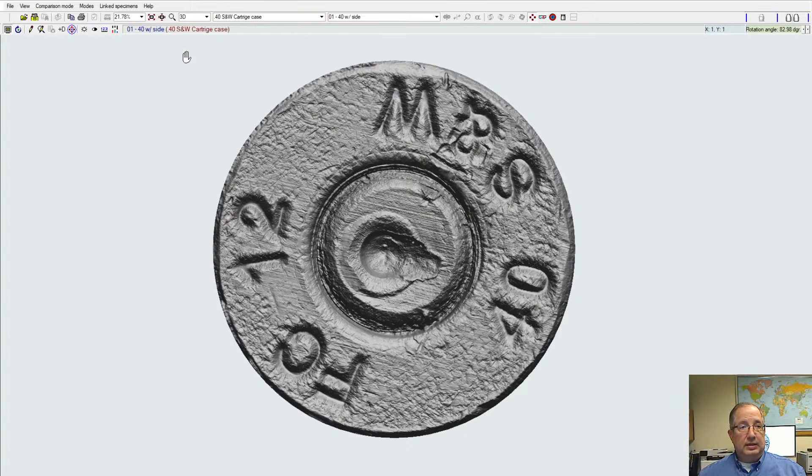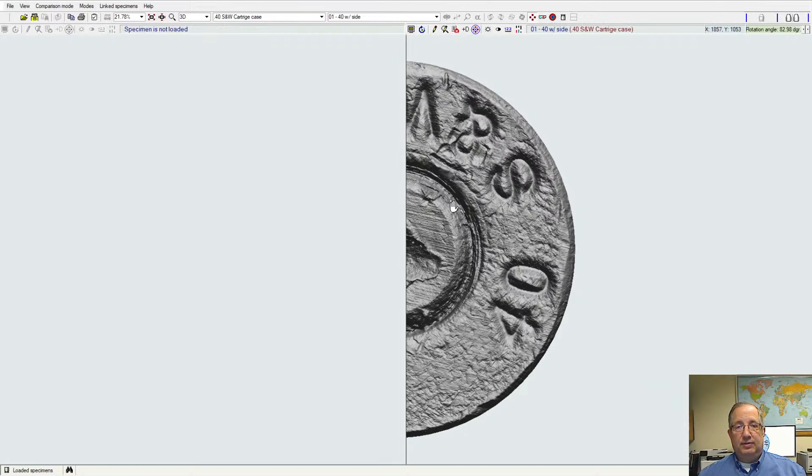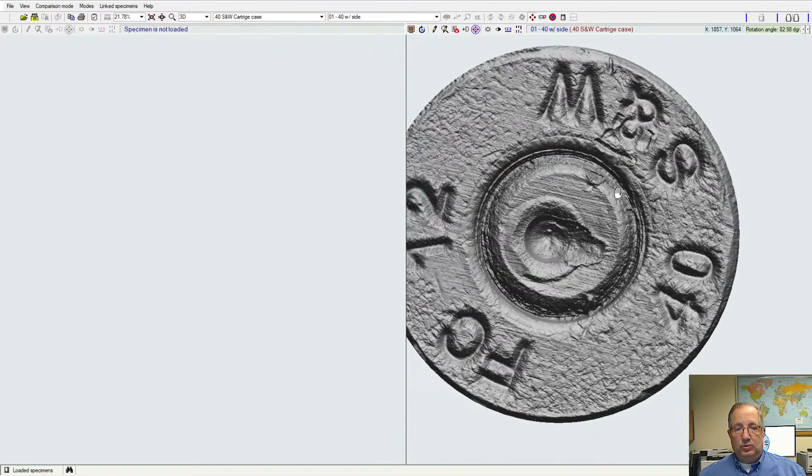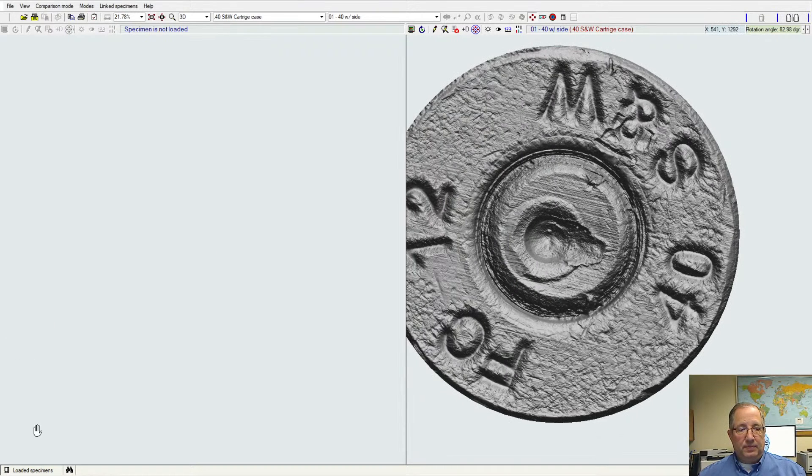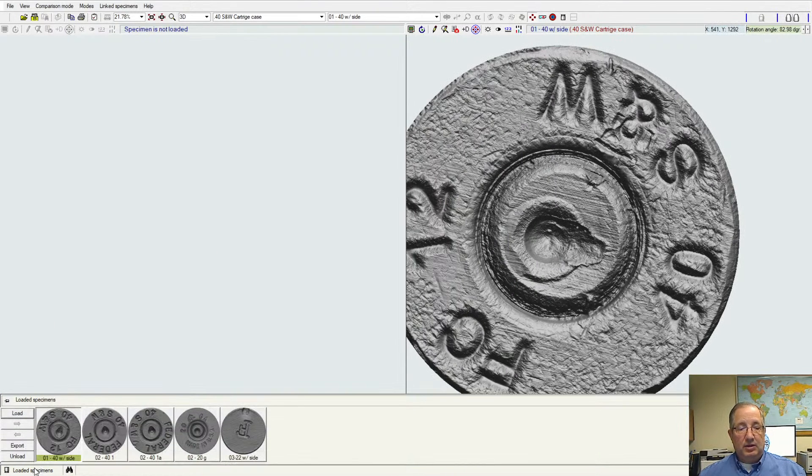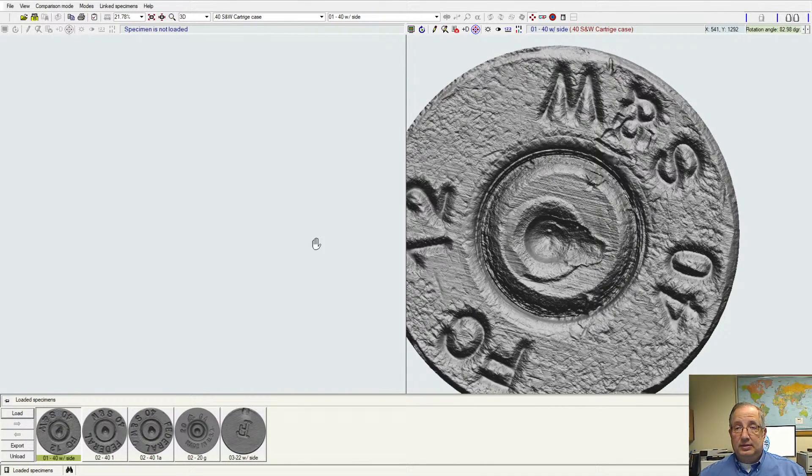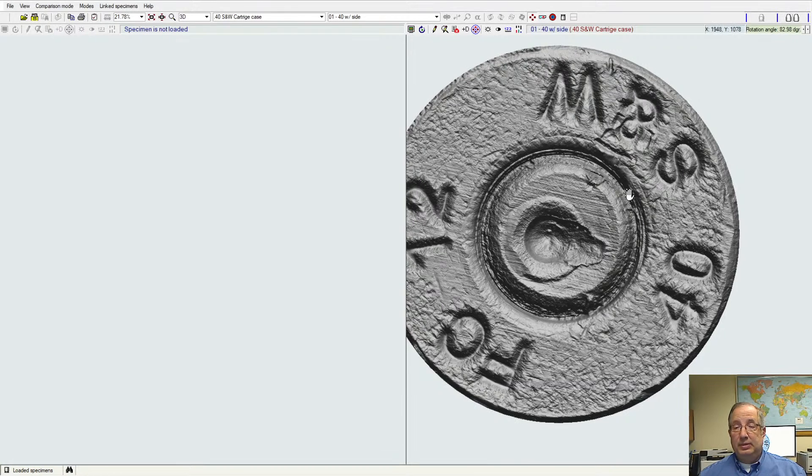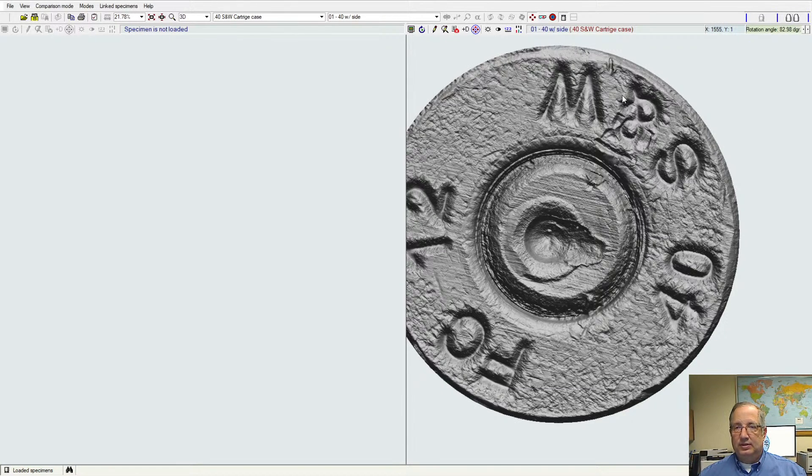Now one of the nice things about this is there's a lot of things that we can do with the software. We can also look at comparison samples, and because we scan the sides of the cartridges, we can also view the side of the cartridge case itself to see that instead of just the face.